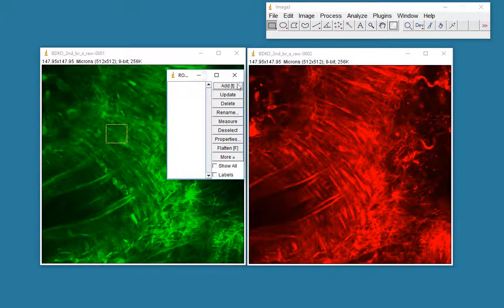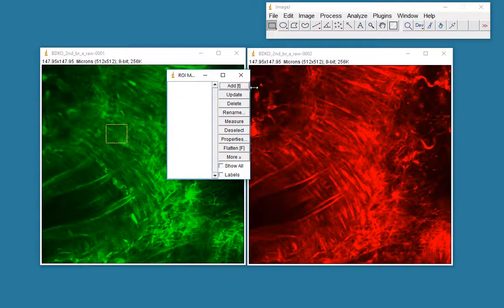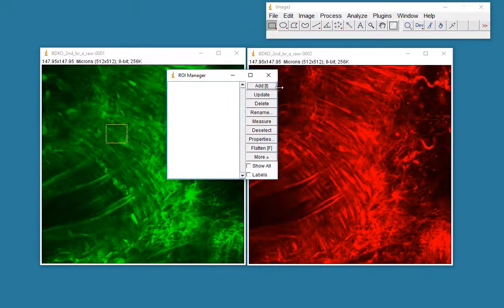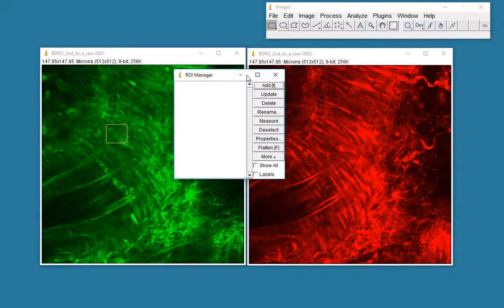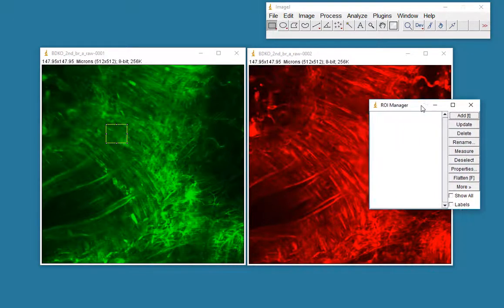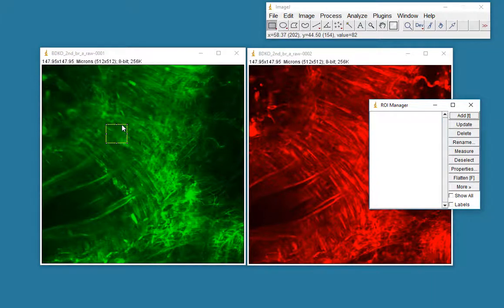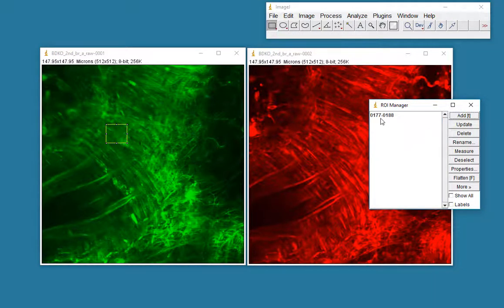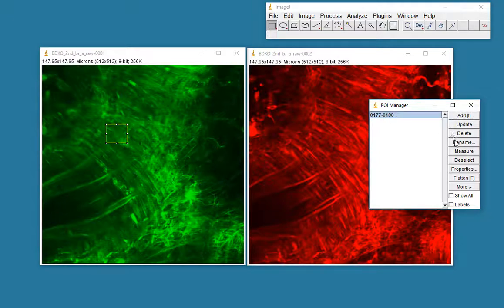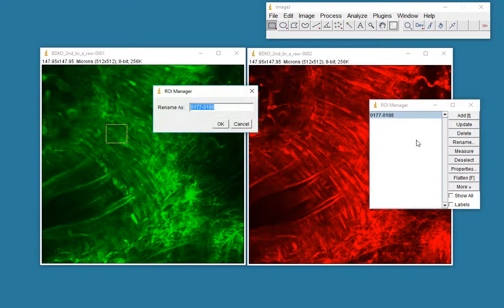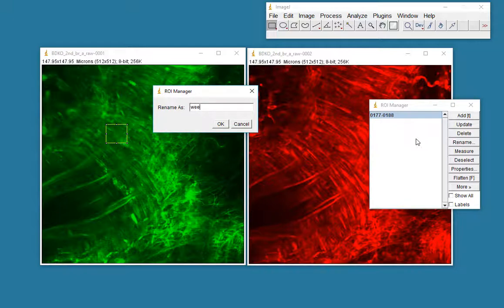Here's my region of interest manager. As you can see, it's named there. Now, I've got that region selected. If I add it, I'm going to rename this. So I'll select that and I'll rename it. You can give it a proper name. I'm just going to call it WeBox1.